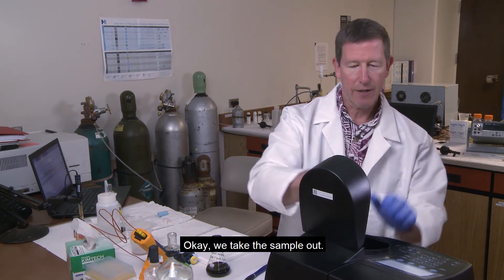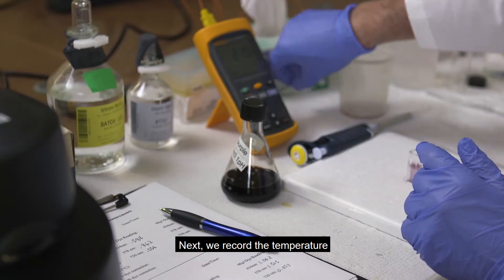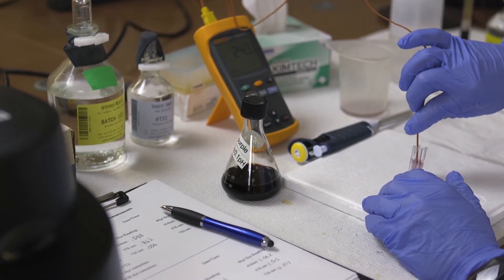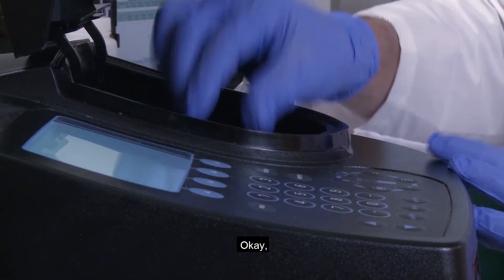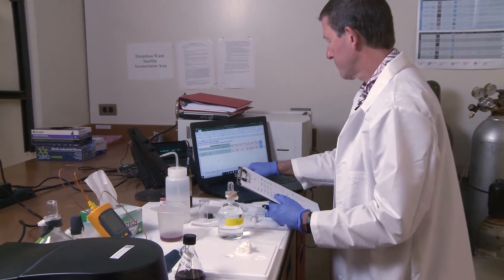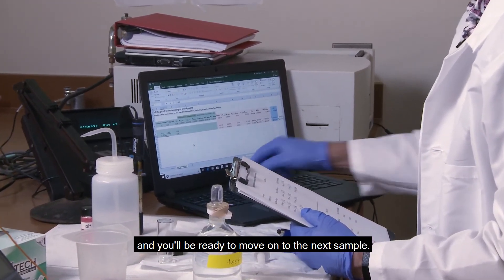Take the sample out and record the temperature: 24.3. Now we're done. All we need to do is use our computer to calculate the pH and you'll be ready to move on to the next sample.